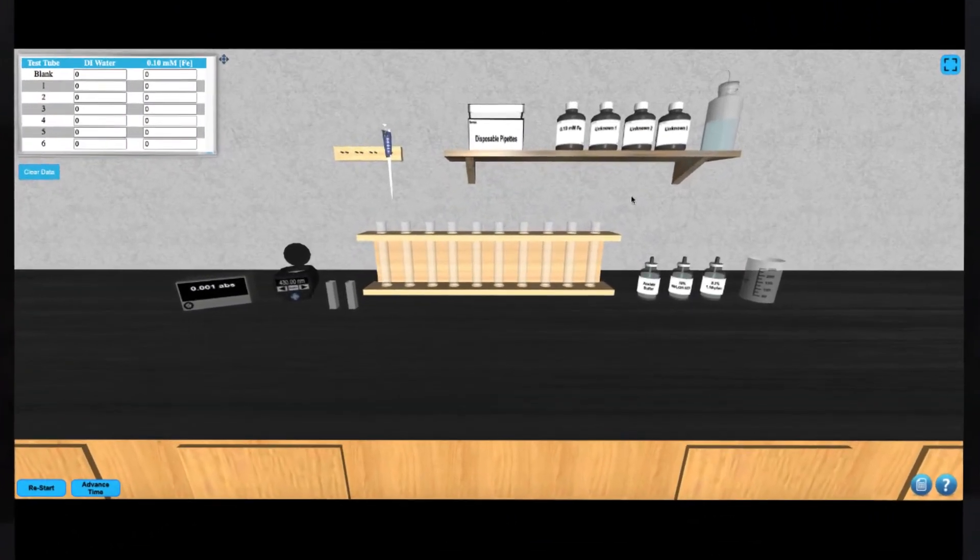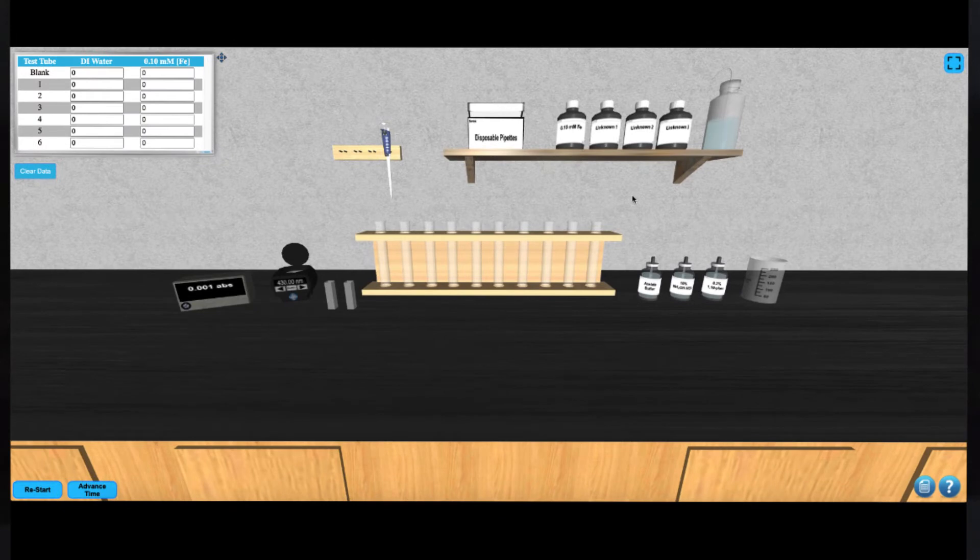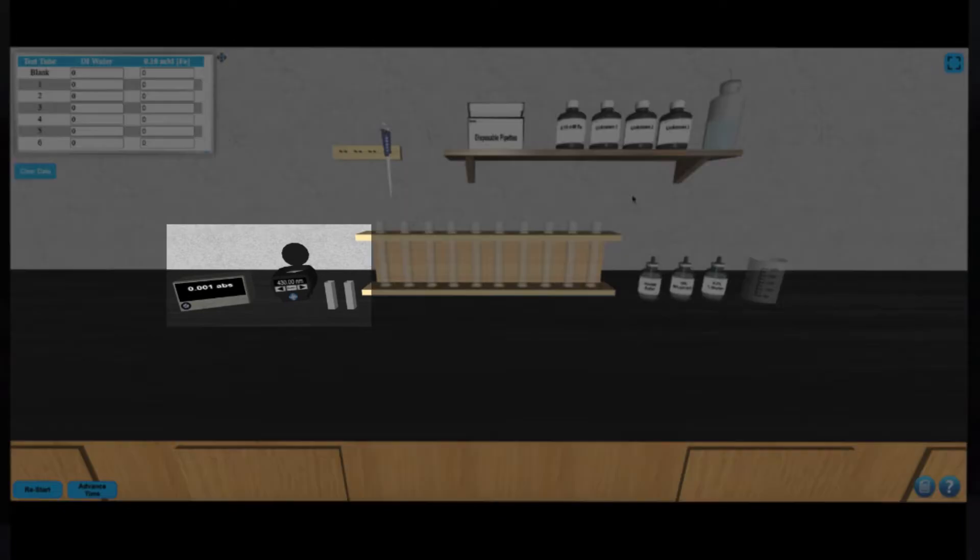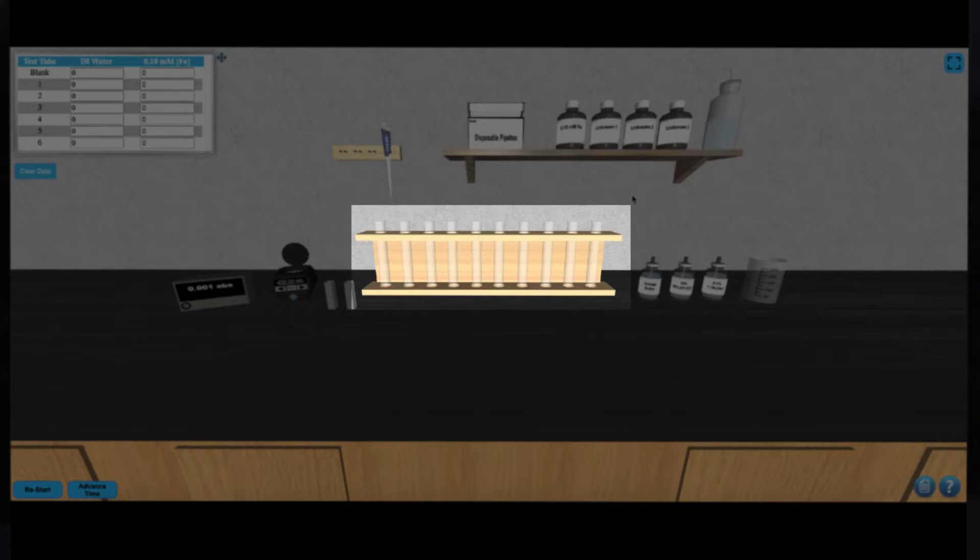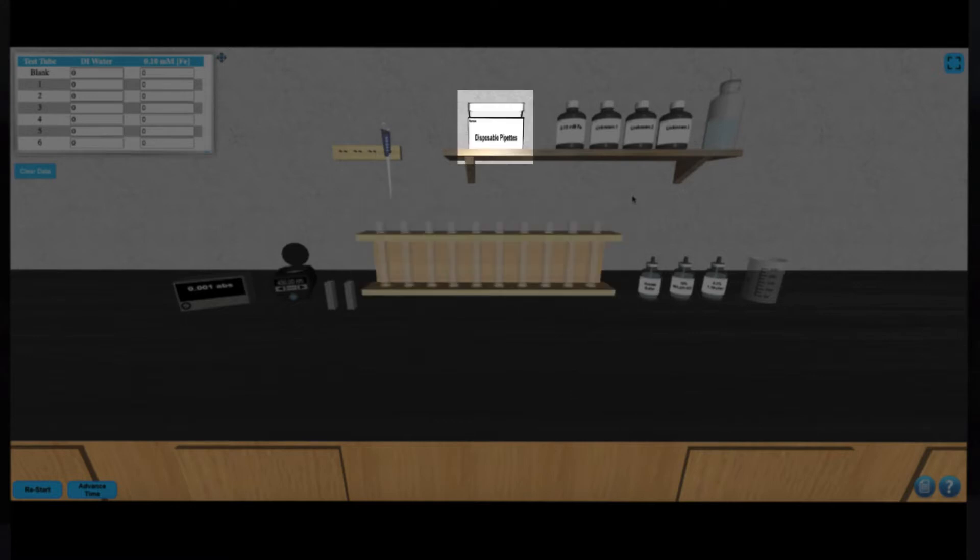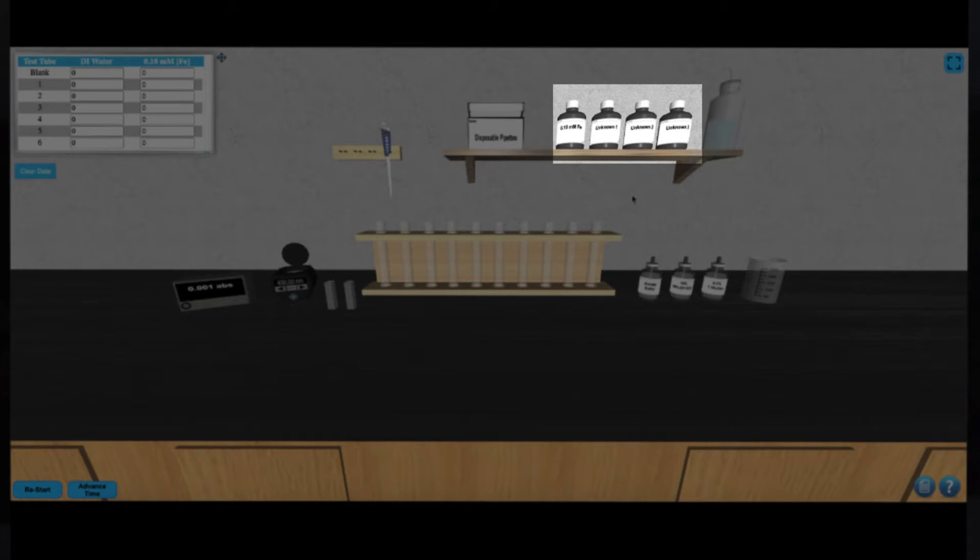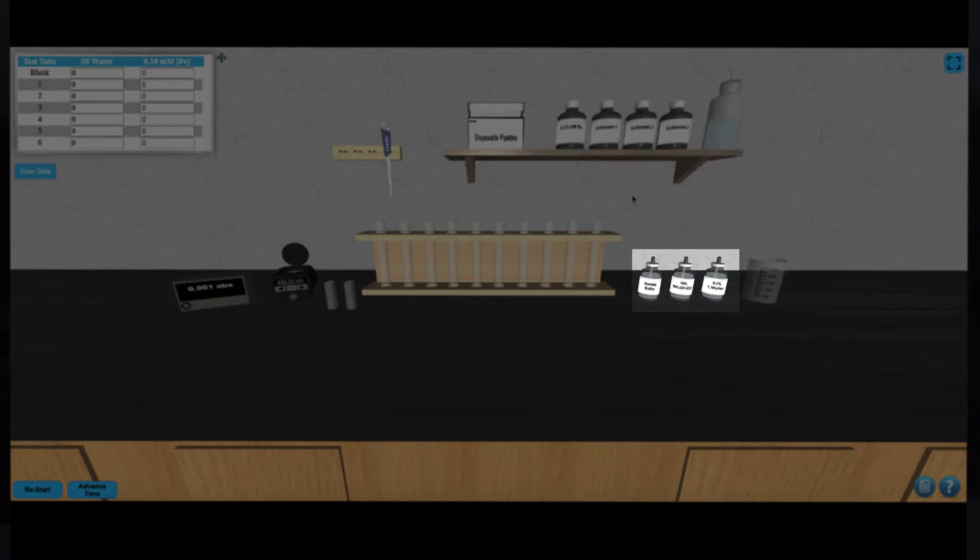In this simulation, we have a colorimeter with some cuvettes, a variable volume autopipet, a series of 10 test tubes, disposable pipettes, iron solutions, deionized water, some reagents, and a beaker.